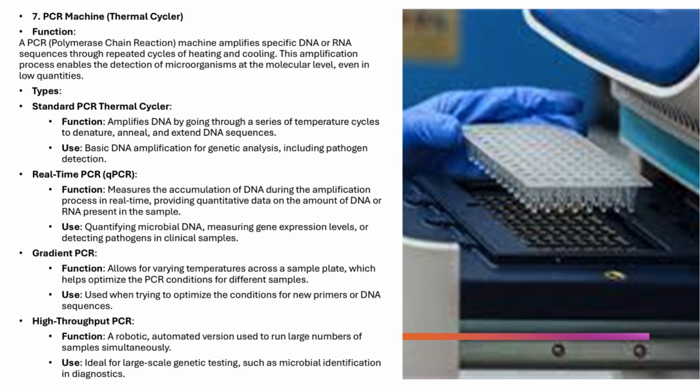Real-time PCR, qPCR. With real-time PCR or qPCR, you don't just amplify DNA. You can also measure the accumulation of DNA as it happens, providing quantitative data. This makes it ideal for tasks like quantifying microbial DNA, measuring gene expression levels, and detecting pathogens in clinical samples.